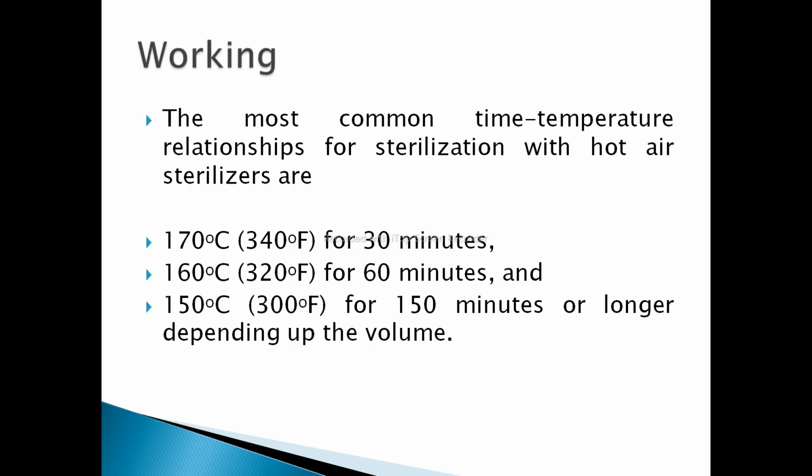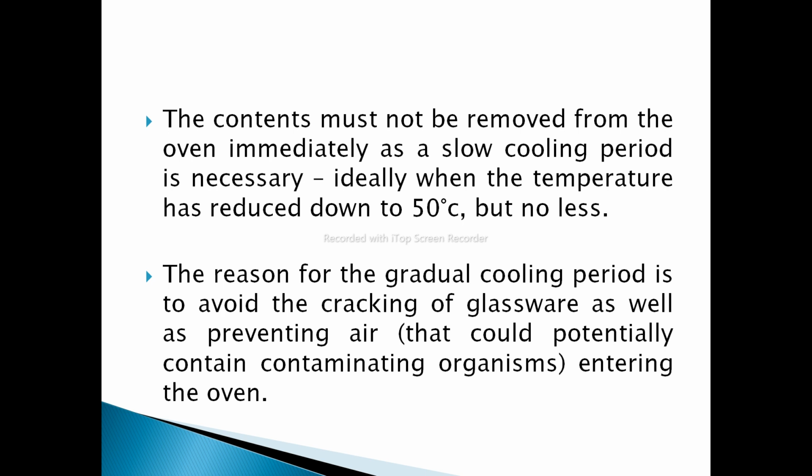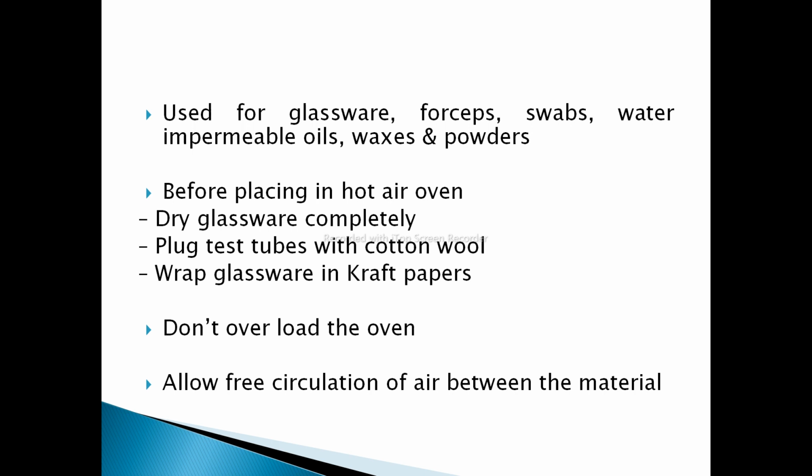Regarding the working principle, if you sterilize for 30 minutes, you have to give 170 degrees centigrade or 340 degrees Fahrenheit. If you sterilize for 1 hour or 60 minutes, the temperature should be maintained at 160 degrees or 320 degrees Fahrenheit. If you carry out for 150 minutes or longer, then 150 degrees centigrade or 300 degrees Fahrenheit is sufficient for sterilization. The contents after sterilization need to be cooled, otherwise they may crack. After that we can bring them out.